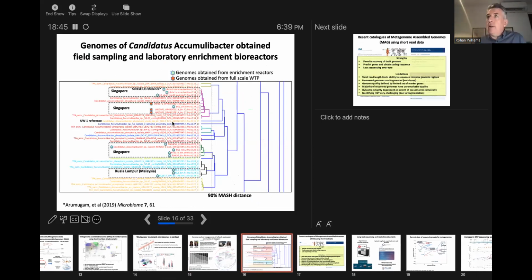And we can do other kinds of analyses with this. We can of course pick off individual species. That phylogenetic analysis lets us do that. And here, for example, we're comparing different genomes of a species in a genus called Candidatus Accumulibacter. And this is a key species for the preferential accumulation of phosphate from wastewater streams, which is an important chemical to remove, but also an important chemical to potentially recover, because phosphate mining is becoming increasingly difficult.